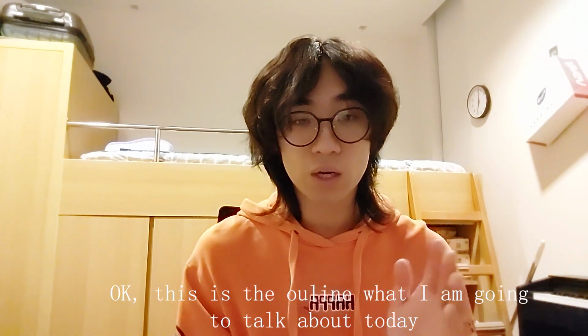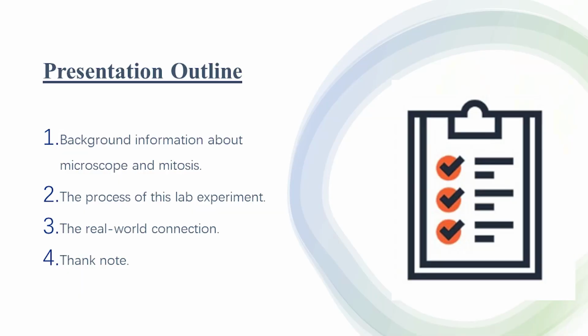Okay, this is the outline of what I'm going to talk about today. First, some background information on the microscope and cell division. Second, I will review the process of this lab experiment. Third, I will analyze the real-world connection of these experiments, which I'm most excited about. In the end, this video covers a thank-you note to those I want to thank.